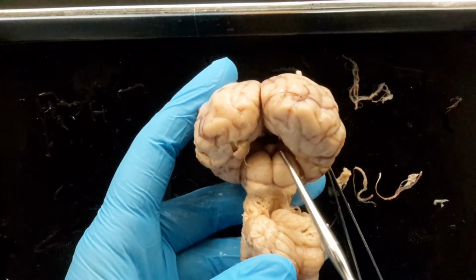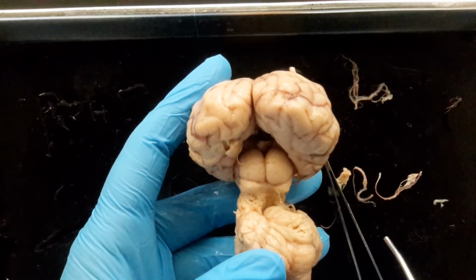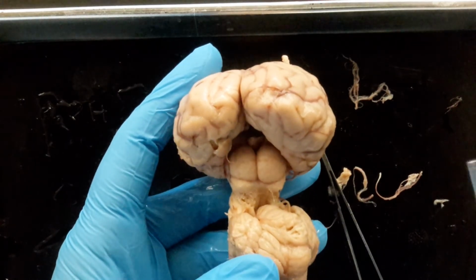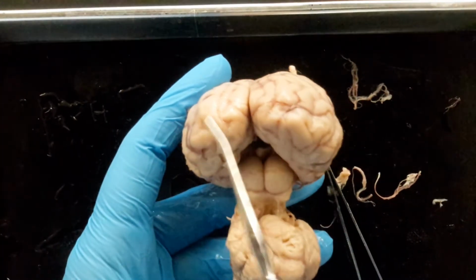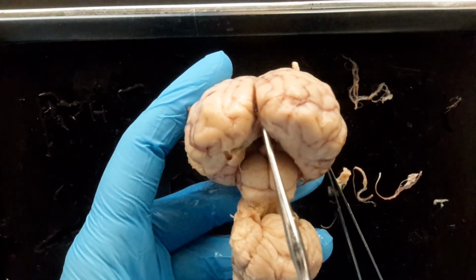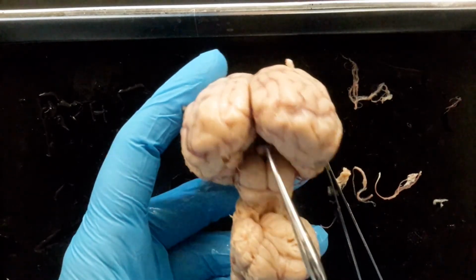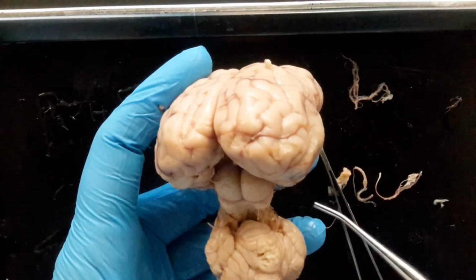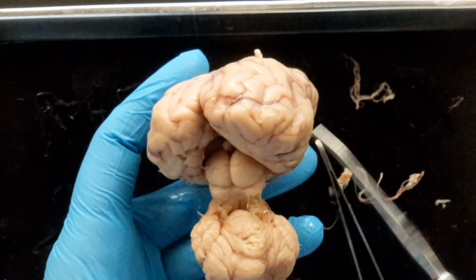It's kind of hard to see under there. That little dude, that's your pineal gland. It produces melatonin, and it's important in your sleep-wake cycle. So when you're cleaning, you're going to clean away the tissue so that you are able to visualize that pineal gland. Just remember, don't pull so hard on here that you break the tissue. Some of them are already slightly damaged, like this one. That's okay. Just do your best.